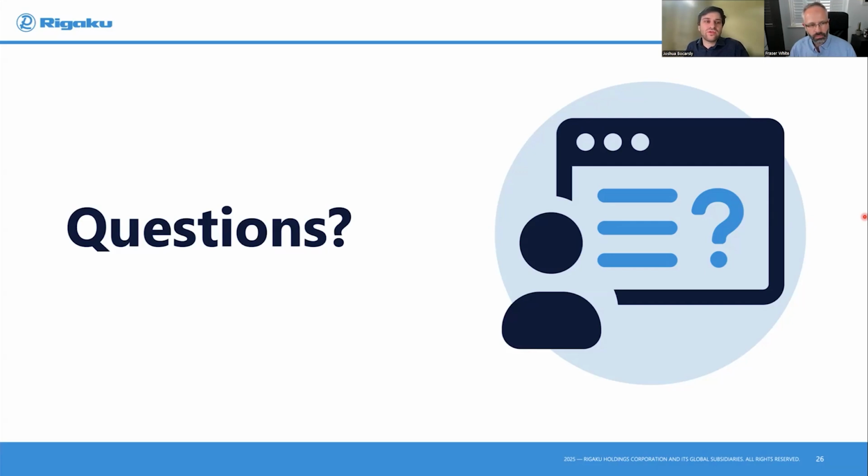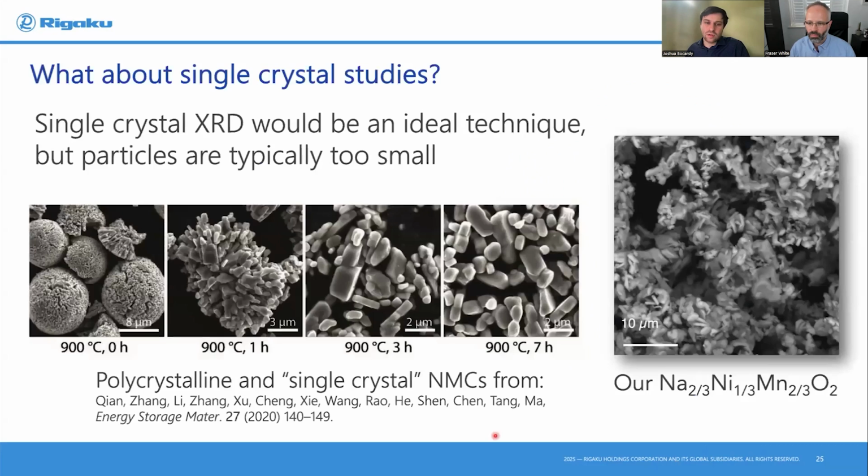From those SEMs, you can see grain boundaries sometimes. If you want to really confirm, you would probably need to pull out individual crystals. Oftentimes we have pulled out individual crystals from those and found out that they're really multi-crystals. So that's a good question. I would say you can't easily, but certainly you can see the difference between the single crystal style materials and the polycrystalline. But it doesn't mean, strictly speaking, that they're all perfect single crystals.